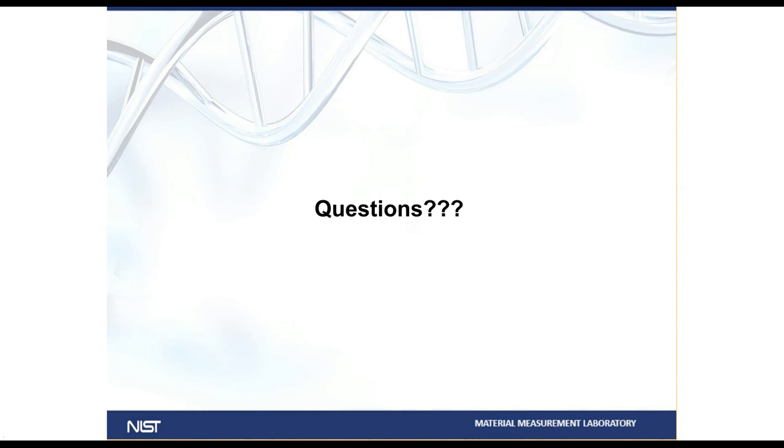I don't even think that level of inaccuracy is completely understood or has been shown exactly what it is, but certainly even theoretically we don't expect it to be as accurate as it would be if you had micron-sized beads to do the calibration.